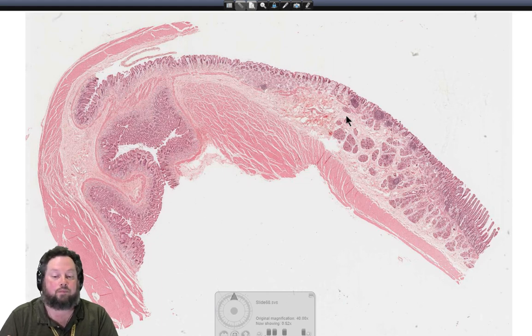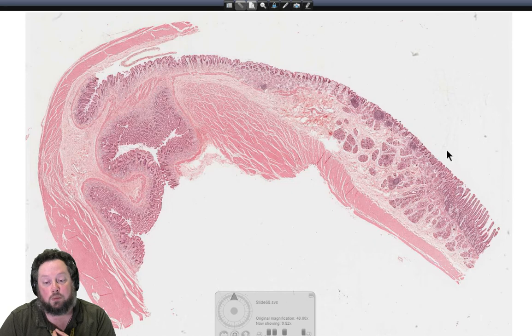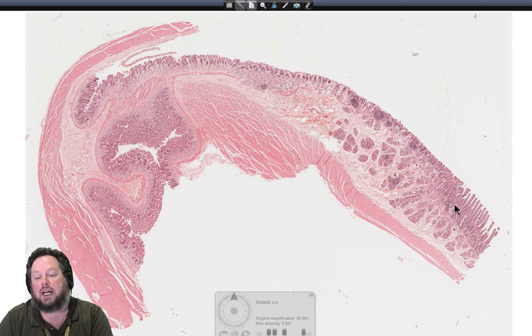But there we're moving from an epithelium that is stratified squamous, non-keratinized, to a simple columnar, whereas here we're actually moving from a simple columnar to a simple columnar. You won't see that epithelial transition, with the exception that we're going to have different cell types. You know, we're actually going to see evidence of goblet cells for the first time in our track down the gastrointestinal tract. So these structures here, they've come a little bit early.